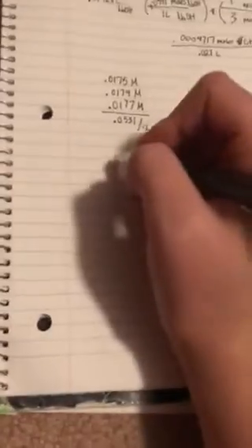And lastly, we're going to compare the averages of the pHs that we found. My average pH before the titration was 2.813, and my one after was 8.713. Basically, to explain this, as the number decreases, the acidity increases. By that I mean the lower the number from 1 to 14 for pH, the more acidic it is.